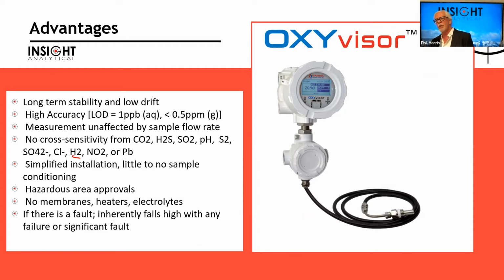So we have a particularly difficult gas phase application where there are some materials that would attack the surface. And so what we've done is put a very light Teflon coating.